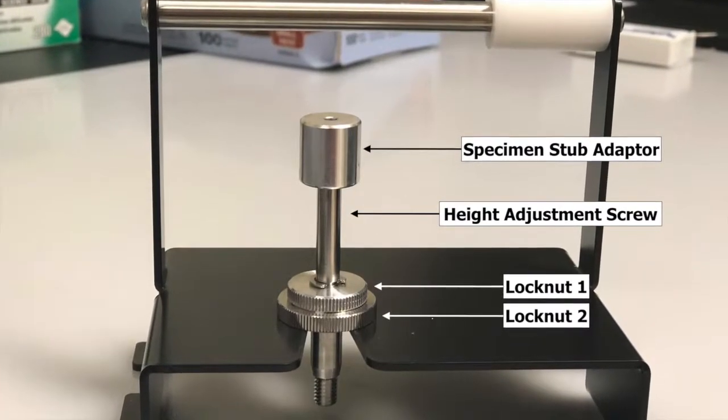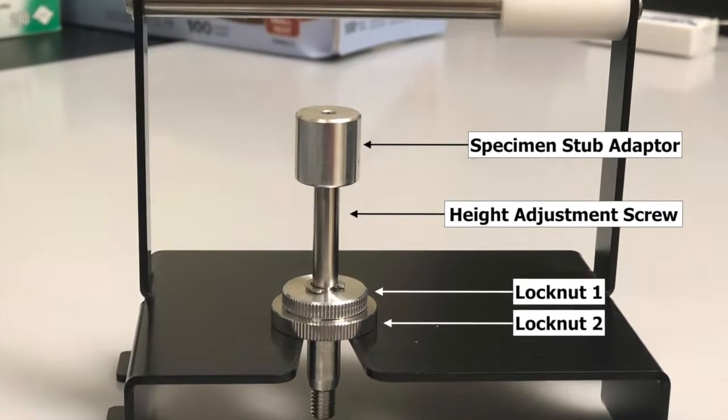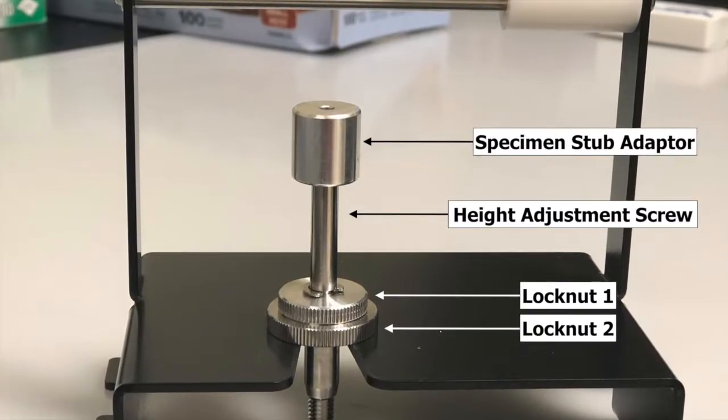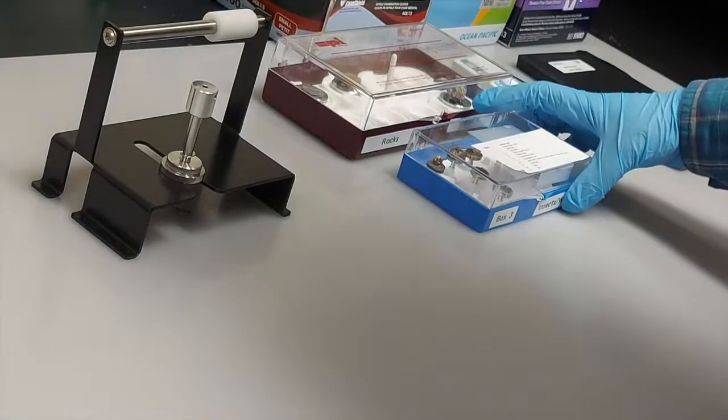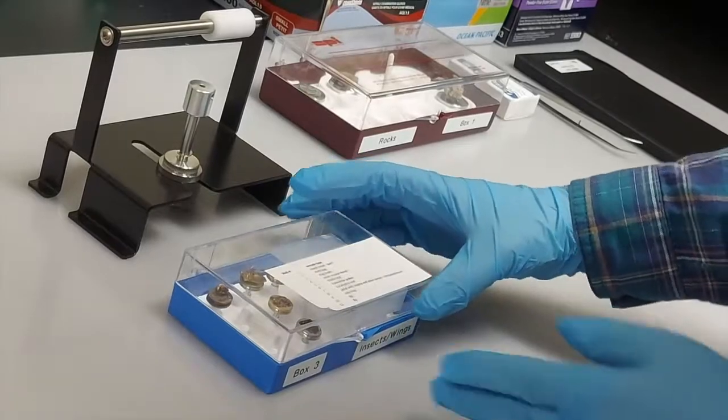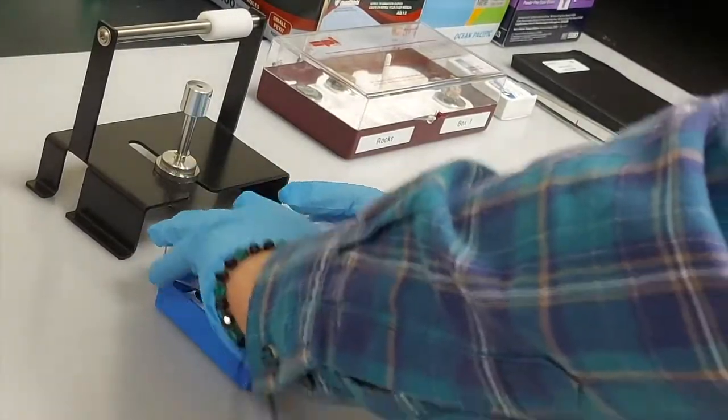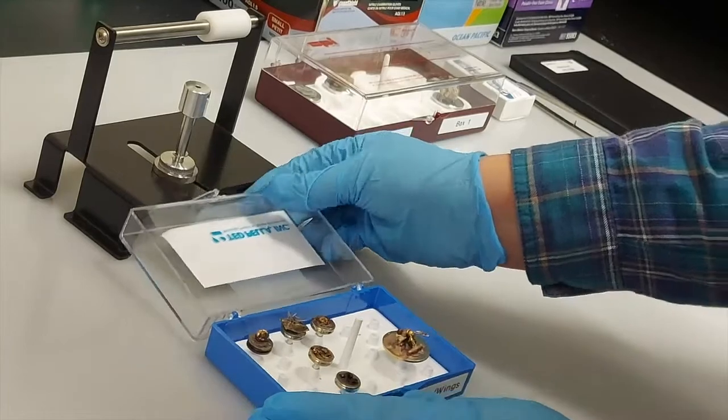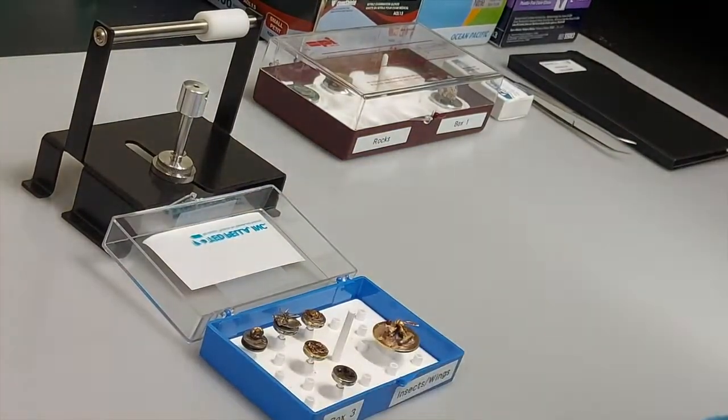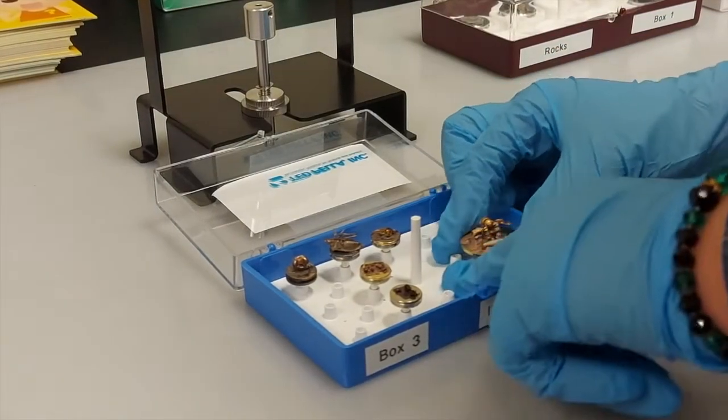Set up the sample holder apparatus as shown if not already done. Take the box of the sample you would like to observe and place it on the table. Take out the sample.